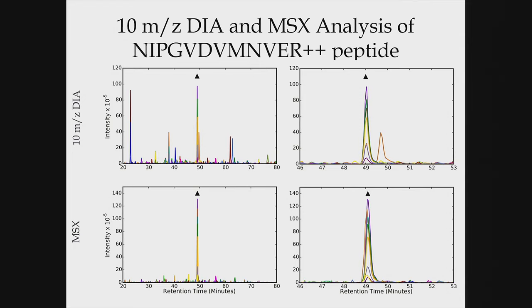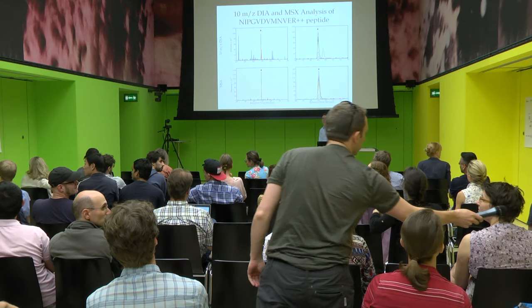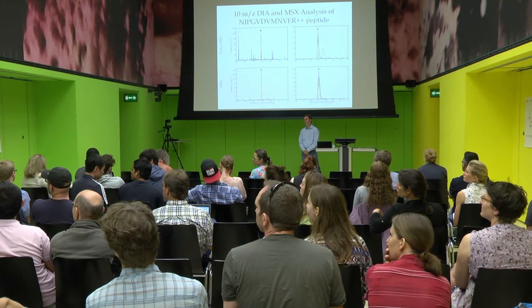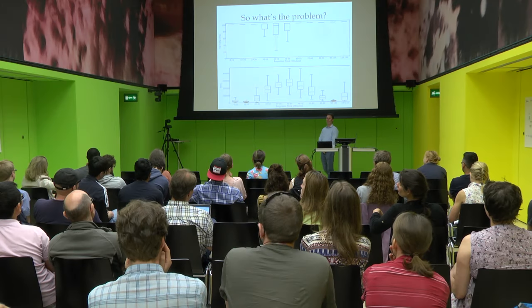Any questions on this? Yeah. Oh, sorry, I got confused. Okay. Is this multiplexing helping? Is it working sequentially, or can you do 5 windows at once? Because otherwise the fill time gets lower and so does your sensitivity. Yeah, it's almost like I planted you there to ask that question, right?